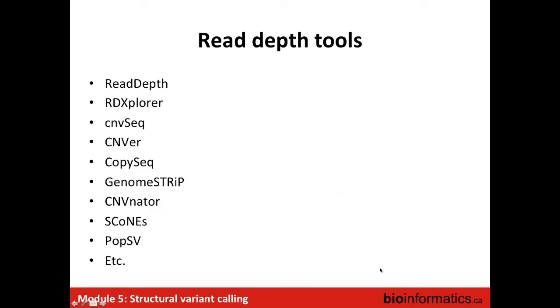So there are many different tools, but not so many tools that are dedicated to cancer. Most of them do a good job in a normal population. It's when you go to cancer and repetitive regions that it starts to be difficult.